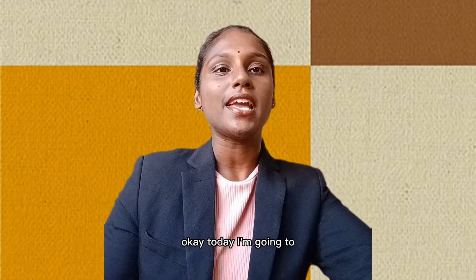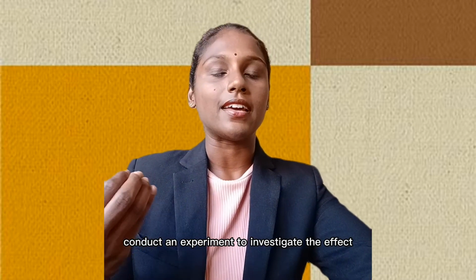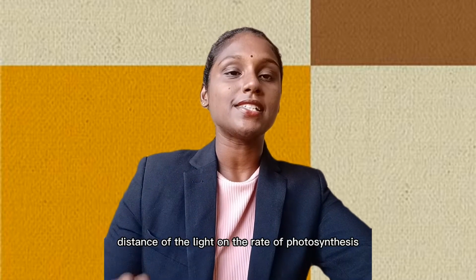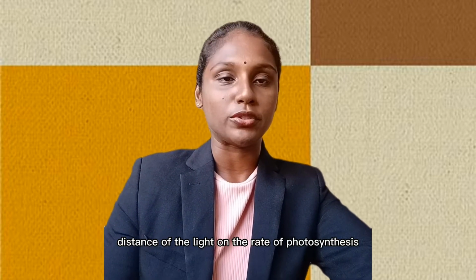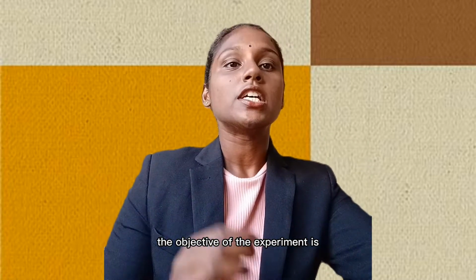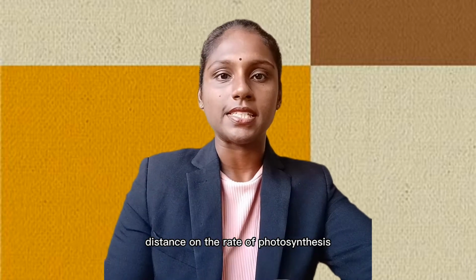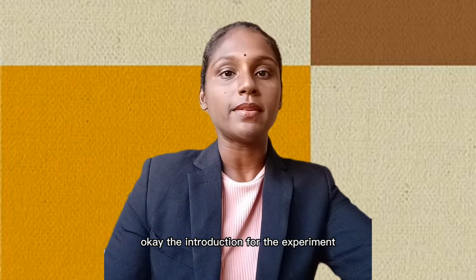Okay, today I'm going to conduct an experiment to investigate the effect of distance of the light on the rate of photosynthesis. The objective of the experiment is to determine the effect of light distance on the rate of photosynthesis. Okay, the introduction for the experiment.